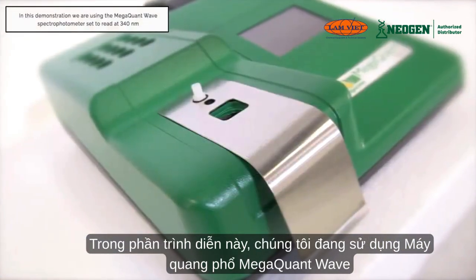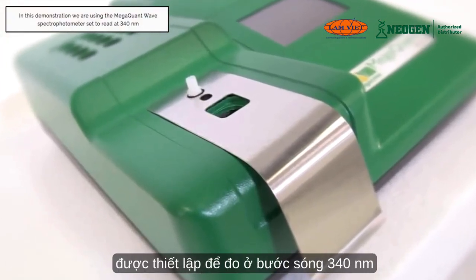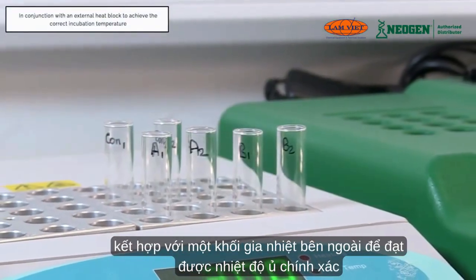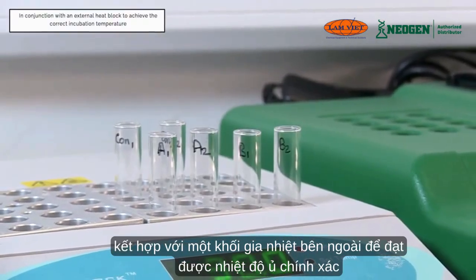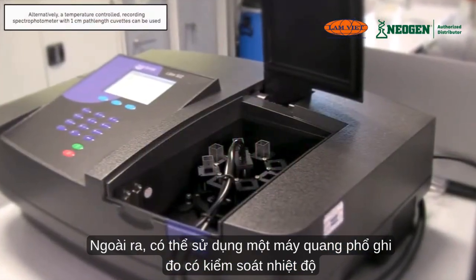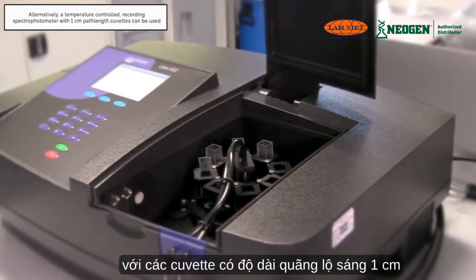In this demonstration, we are using the Megaquant Wave spectrophotometer, set to read at 340 nanometers, in conjunction with an external heat block to achieve the correct incubation temperature. Alternatively, a temperature-controlled recording spectrophotometer with 1 cm path-length cuvettes can be used.